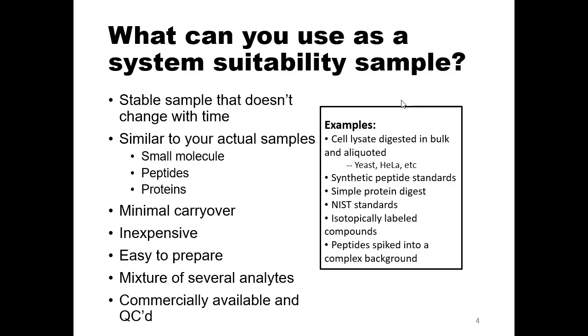We use some kind of a manual approach. We use a standard, and then we pull out all the data in Skyline and try to see whether there is any shift in the detection time. Yeah, that's what I did before AutoQC as well, just dumping everything into a Skyline document and manually going through.